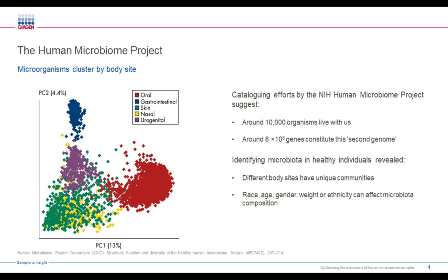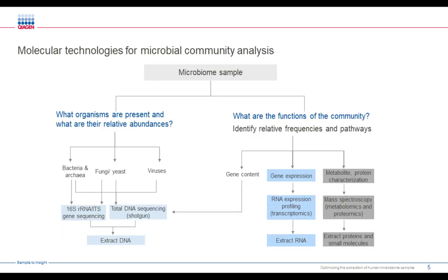And so, of course, it's fascinating to start looking at microbiome samples in order to understand what effect that has on humans. And of course, if you're doing a microbiome experiment, it's very different than simply looking for a single pathogen. So when you're looking for a microbiome sample, you pretty much have to do sequencing downstream, and you're mostly looking for the answer to one of two questions: which organisms are present, and what is their relative abundance? So if you're looking at the community that's present and which organisms may be providing a function within that community, that is on the one side.